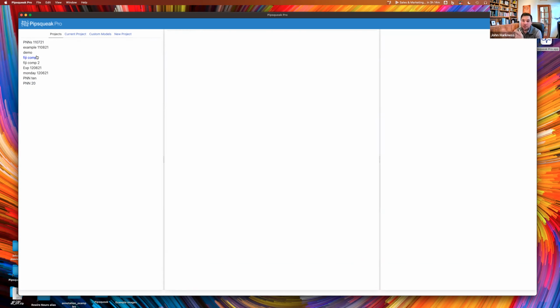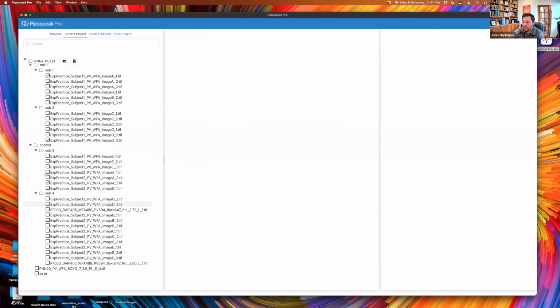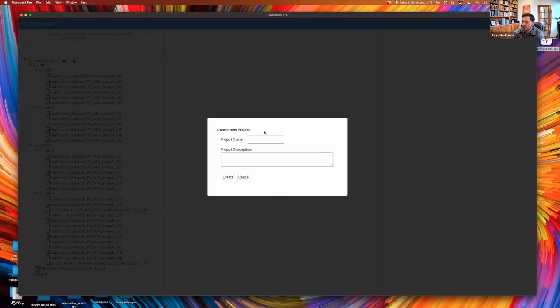And so that's pretty incredible, the ability just to upload your images, get everything plugged in here and get going. You don't have to carry around your external drive anymore to synchronize, to do your analysis elsewhere. So great. I've got my image, I've got some of these projects that I've done before. Let me show you how we start off a new project here.